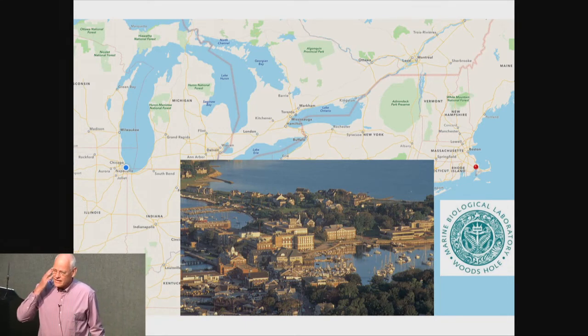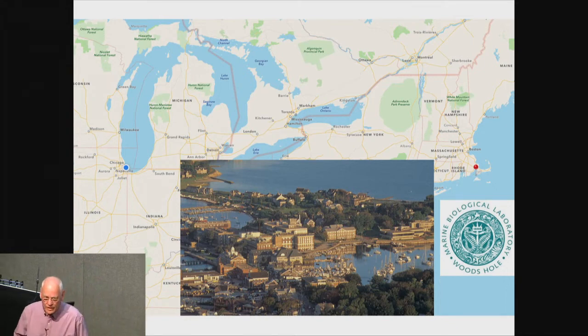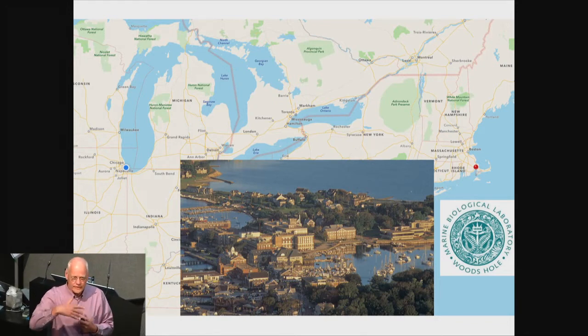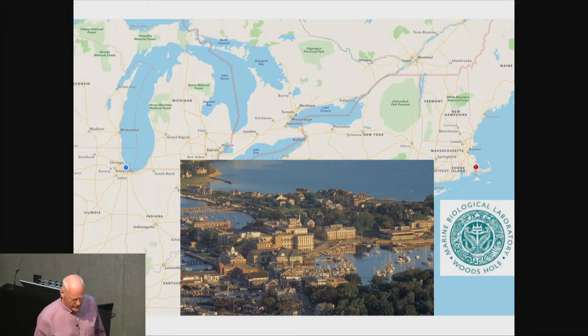While it is easy to generate an image from a known object, if you know its physics and the imaging system, it's physics. But going the other way, from the image inferring the object, is still an ill-posed problem. Mathematically, it often has many solutions, and many solutions that are not physically meaningful.